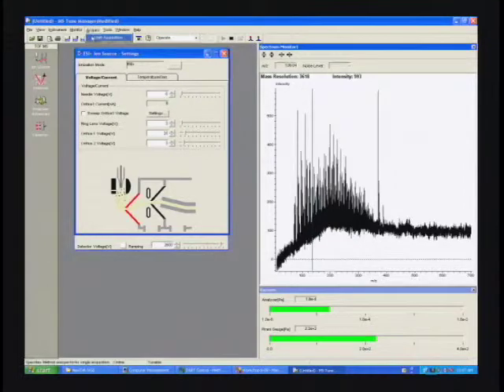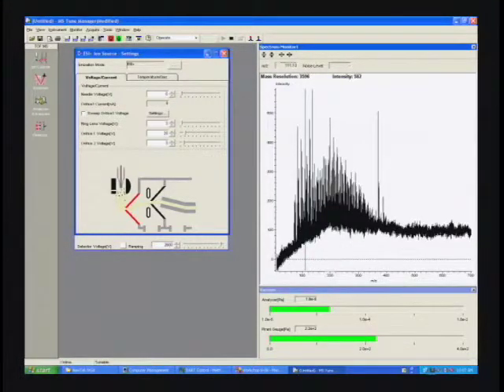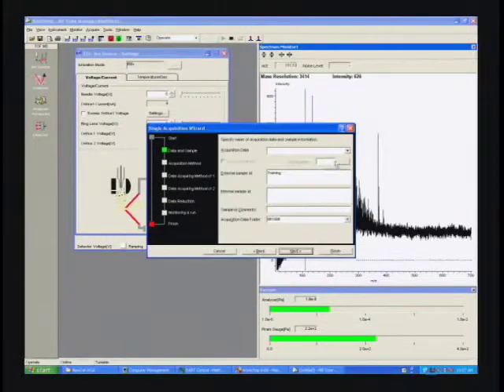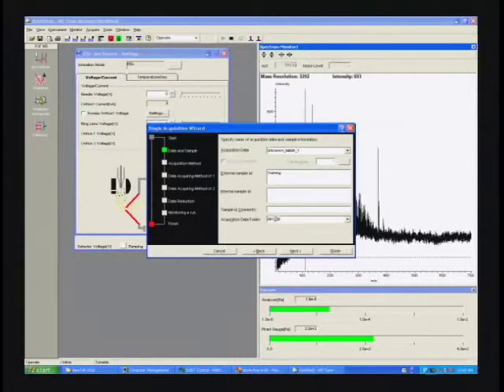Okay, I'm going to go ahead and set up a spectrum acquisition here. So we'll start up the acquisition, and all we really need to do here is to specify the name of the file. Let's just call it unknown tablet, and put a 1 after it in case we got the caps lock key on. And we'll save it in a folder with today's date.